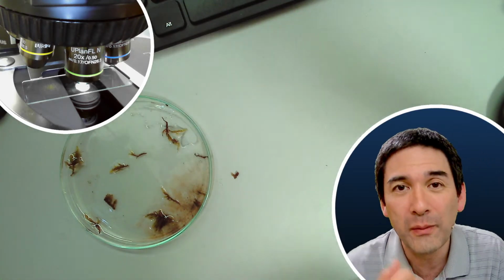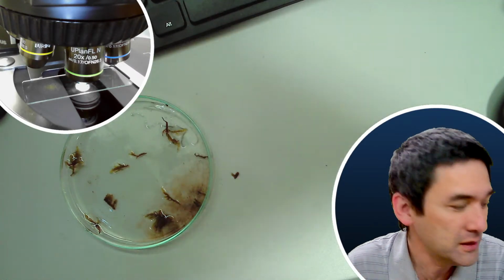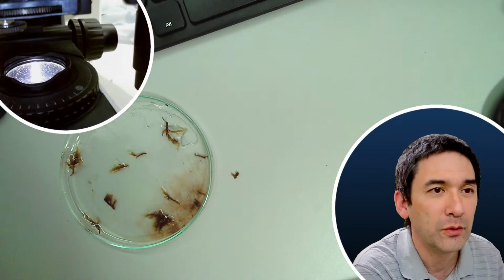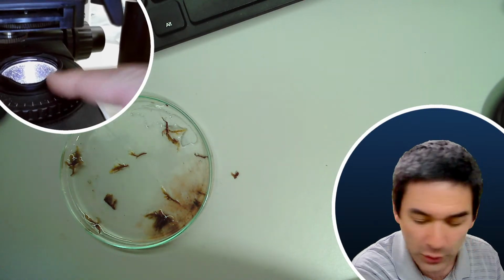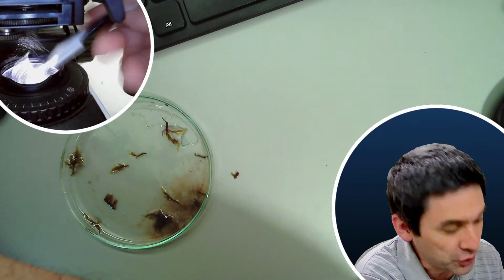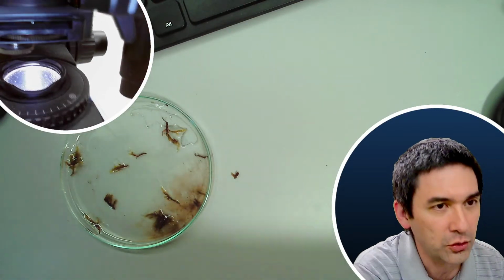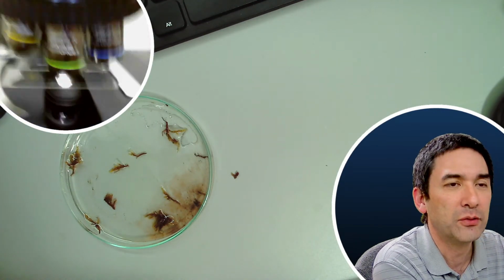So generally I recommend, and I try to do that, to always cover the microscope and to try to minimize dust as much as possible. But you know what, I'm going to just show you again over here on the bottom. You might not be able to see it here, but there is also a lot of dust over here. But because this dust is out of focus, it doesn't disturb a lot. And for these things, I usually use a kind of brush. You can actually see the dust flying around in the light path. So unfortunately, dust is difficult to prevent. But that is simply something that we have to live with.